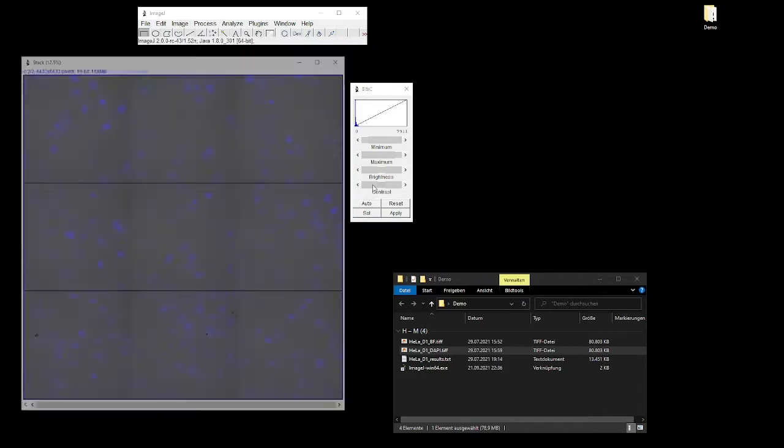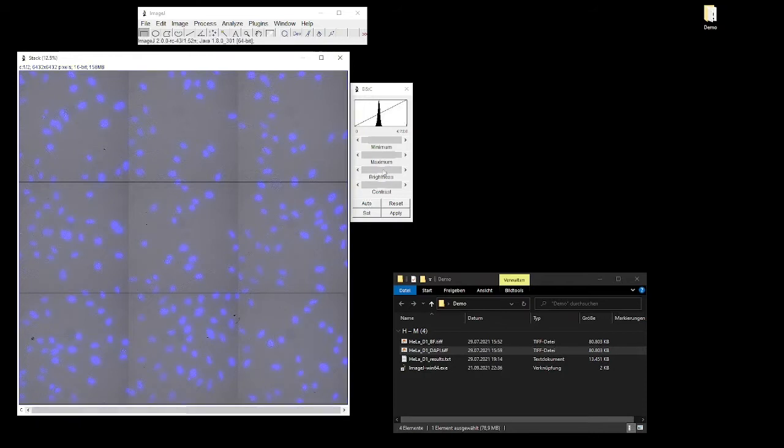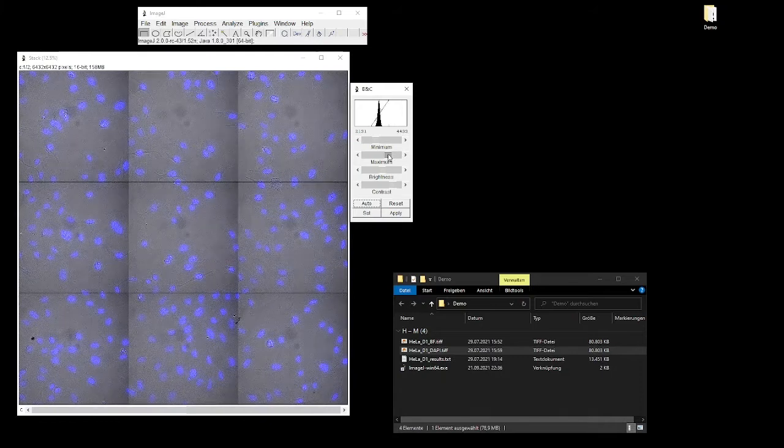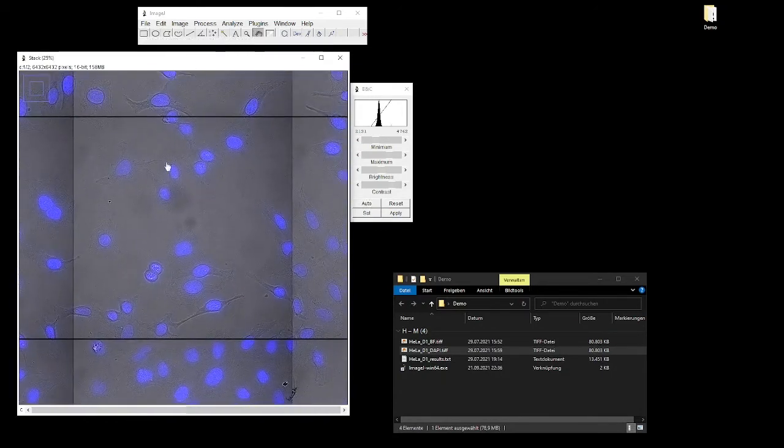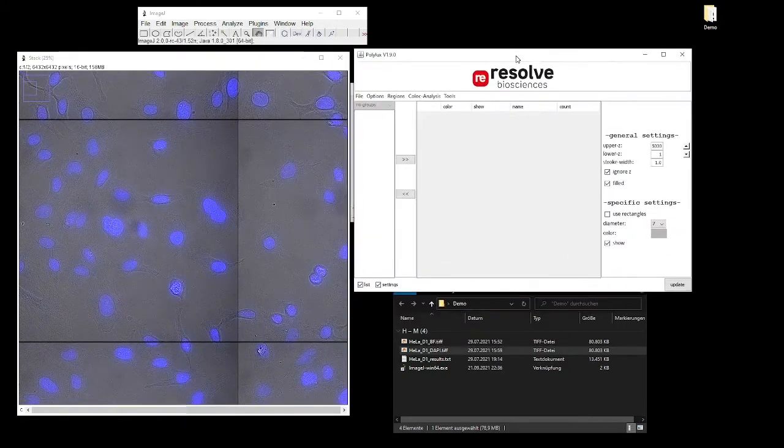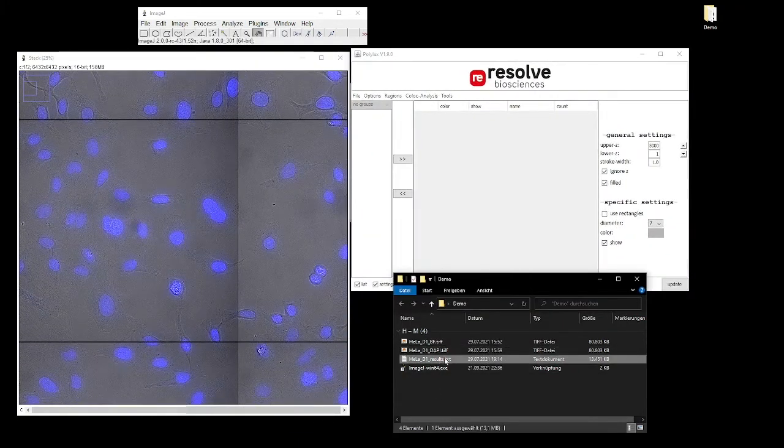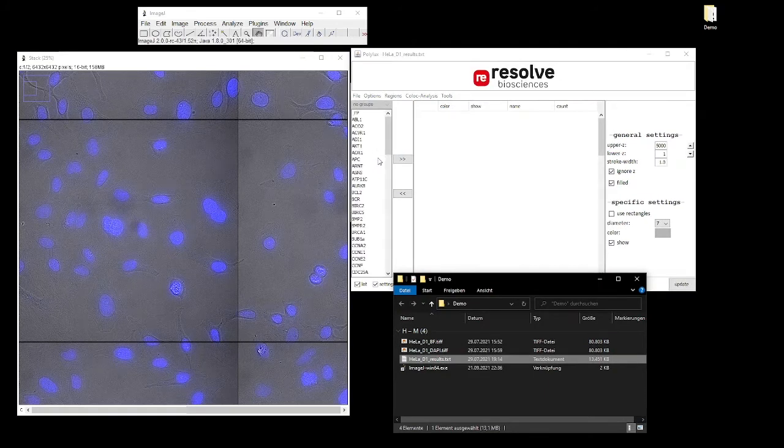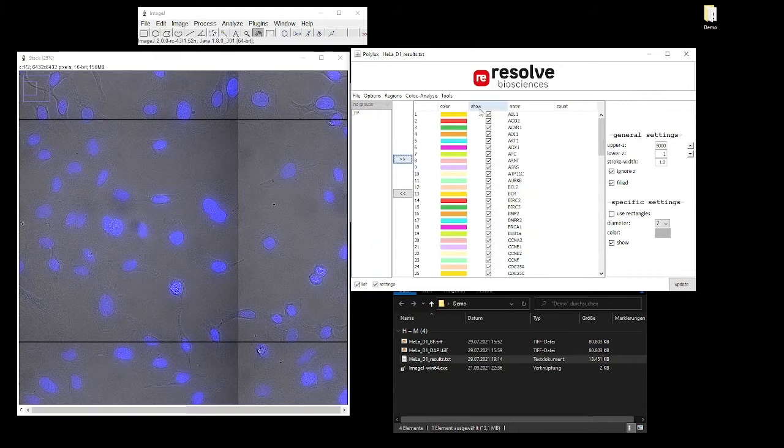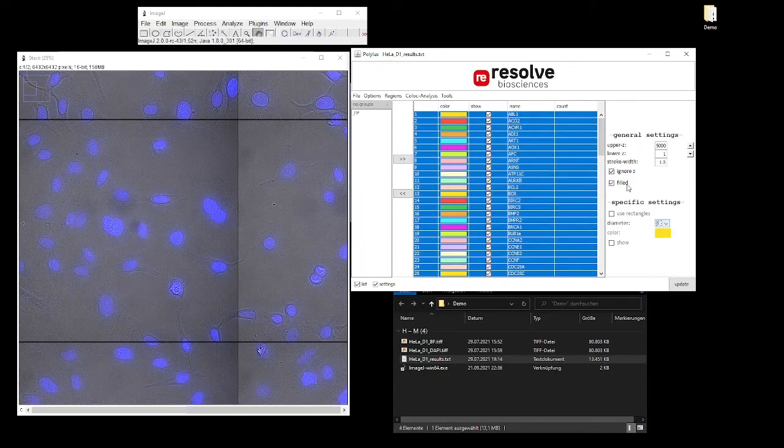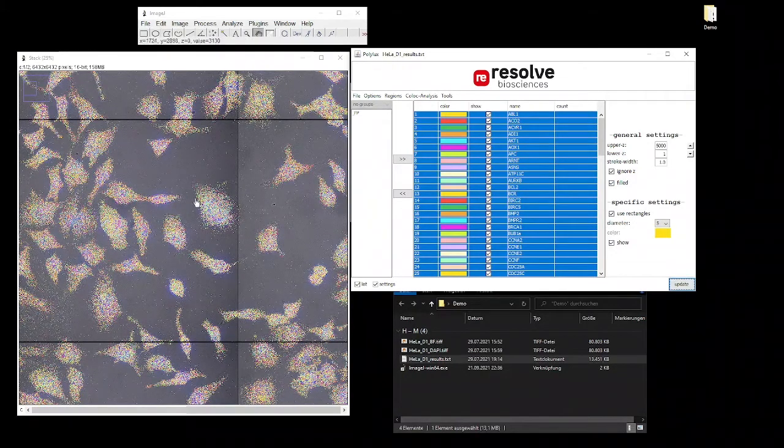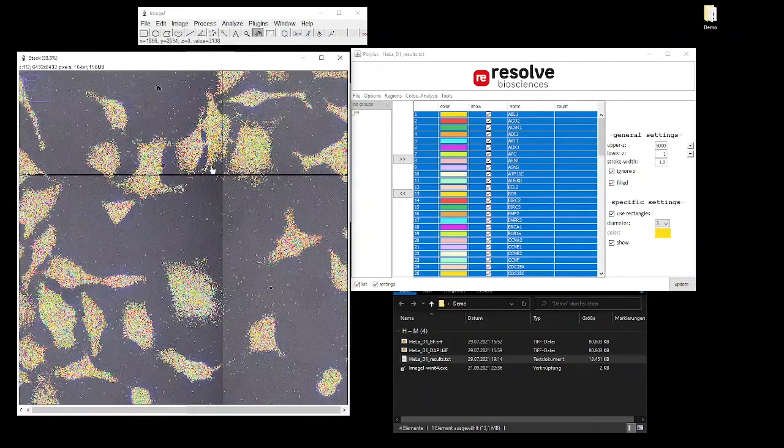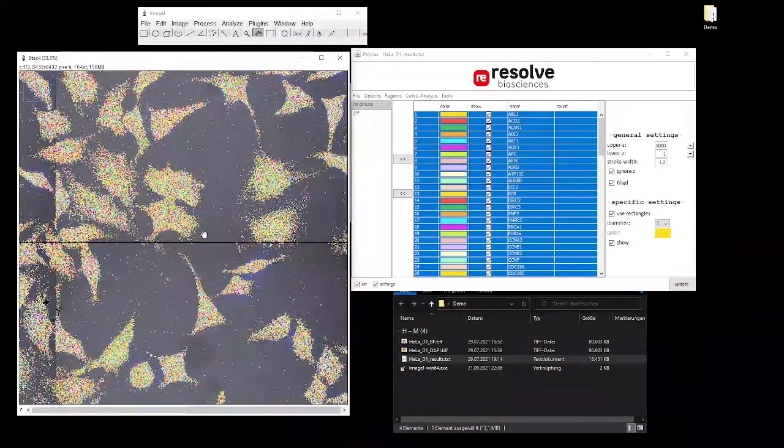The brightness and the intensity can be adjusted to make the picture look nice. Now we have opened the Resolve Molecular Cartography plugin and the transcript list can be loaded by simply drag and drop the text file into the list box and then we can select all transcripts.